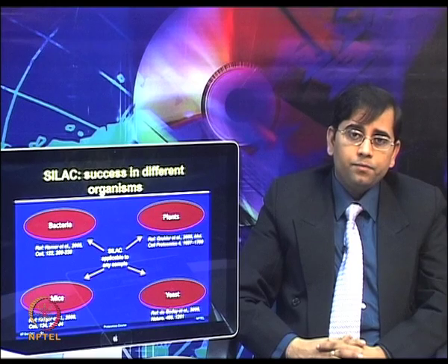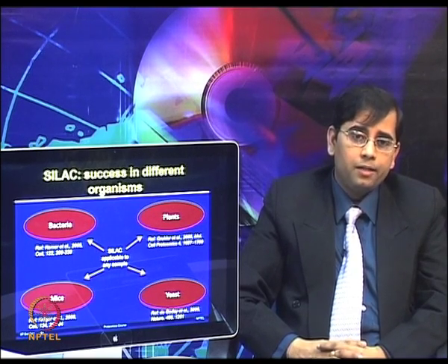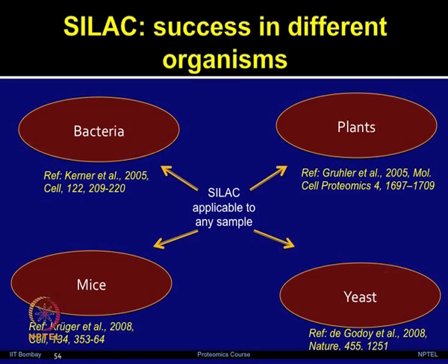Interestingly, the SILAC method has now been used in different organisms. In bacteria and yeast, these were the more commonly used SILAC methods due to the growth in cell culture, but there are some studies on Arabidopsis in plants as well as in mice, which have shown that SILAC can be applied to a wide variety of organisms.